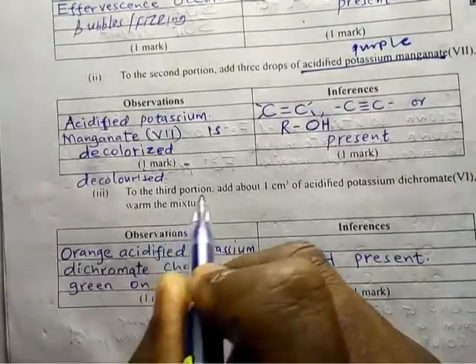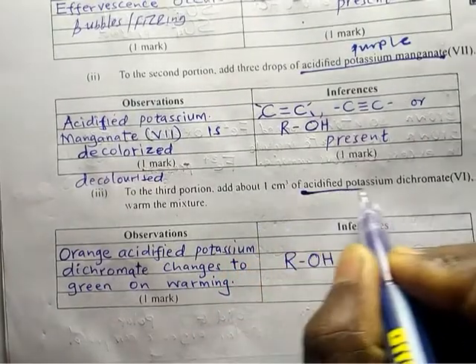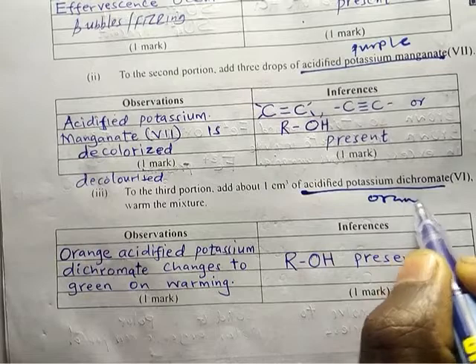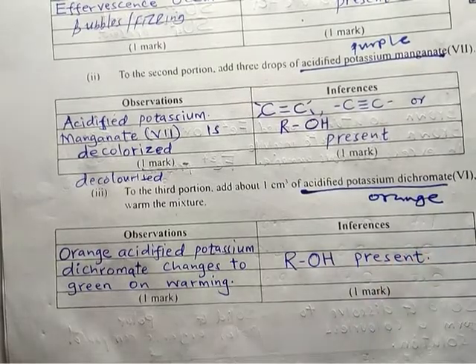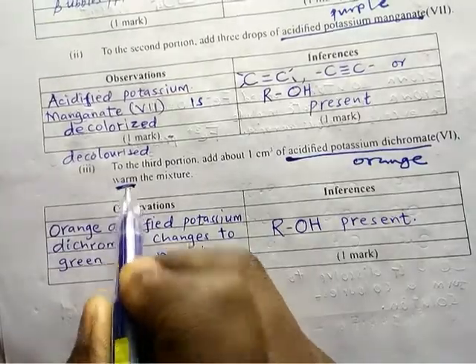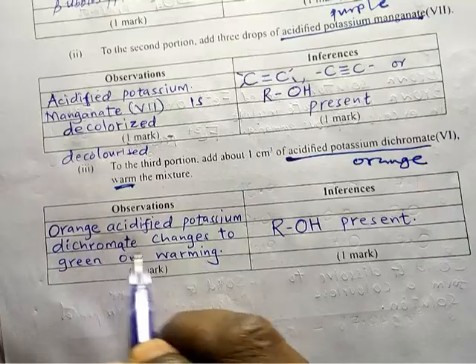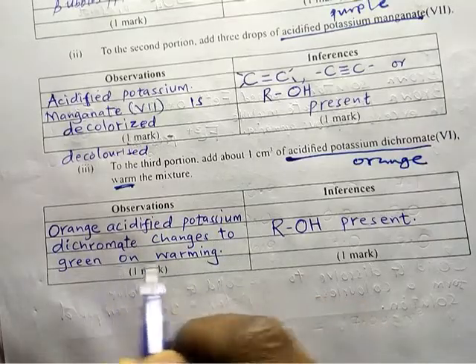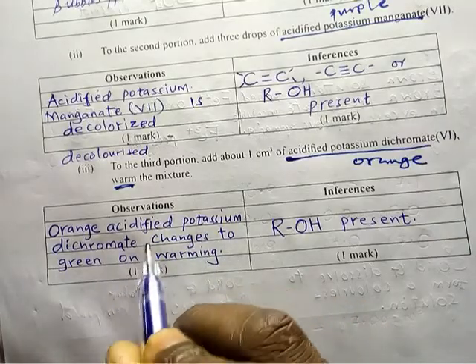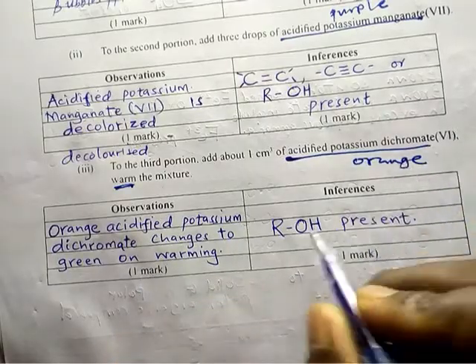To the third portion, add 1 centimeter cube of acidified potassium dichromate. This one is orange. What will happen to that? There was warming. The orange acidified potassium dichromate changes to green on warming. Immediately it changes to green, you should know what is present is an alcohol.